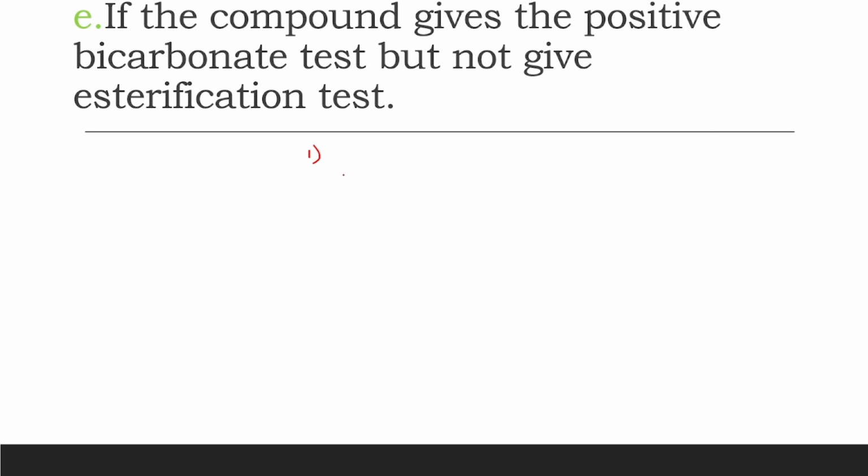One possible reason is that the formed ester may be less volatile. On the other hand, the compound does not contain carboxylic acid.